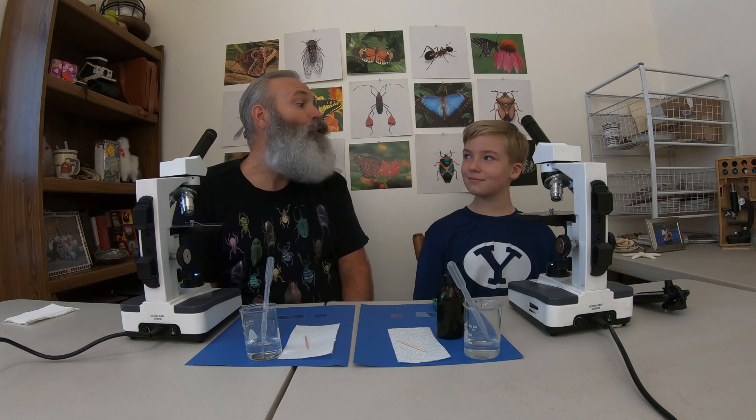Well, Jake, you said you wanted to see animal cells, right? Not just any animal cells — you wanted to see human cells. So that's what we're going to do.